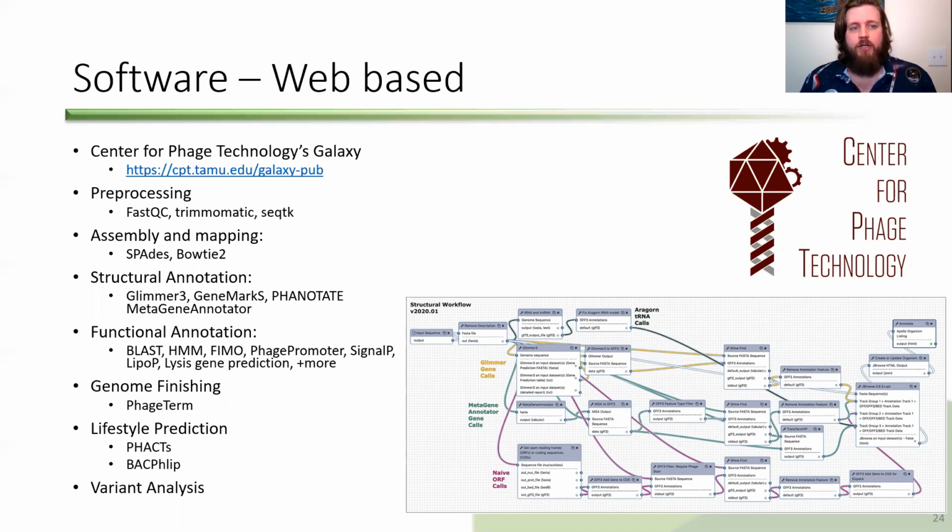They don't have that integrated yet, but I believe they may be working on it, since you really only need the algorithm and the databases. But again, I'm not affiliated with them, so I can't really speak for what they're doing or where they're going. Just recommend checking them out.